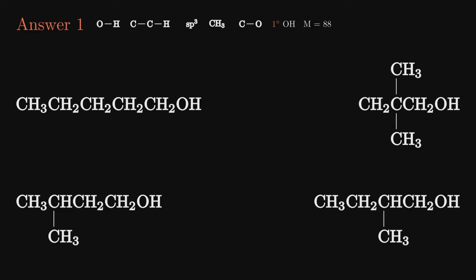We can choose the correct one if we remember what happens when these molecules lose a water. The second hydrogen necessary to form water comes from the third, or gamma carbon, after the alcohol group. For simplicity, if there is more than one option, I pick the location which, after the hydrogen is taken, produces the most stable fragment. Because when the loss of water occurs, the cation produced is also a radical. The more stable the radical, the more likely it will be produced.